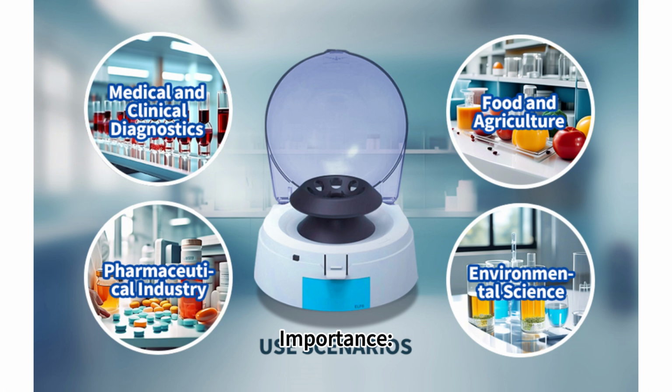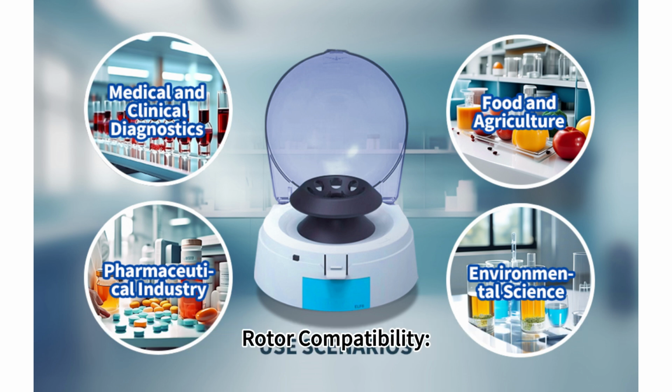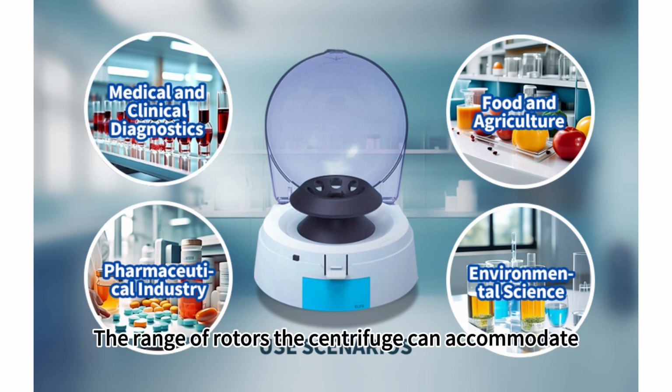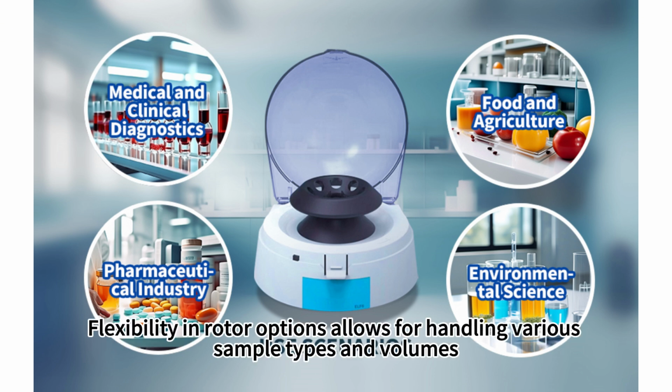2. Importance: Helps determine the centrifuge's suitability for specific applications and sample volumes. Rotor compatibility: 1. Indicates the range of rotors the centrifuge can accommodate. 2. Importance: Flexibility in rotor options allows for handling various sample types and volumes.